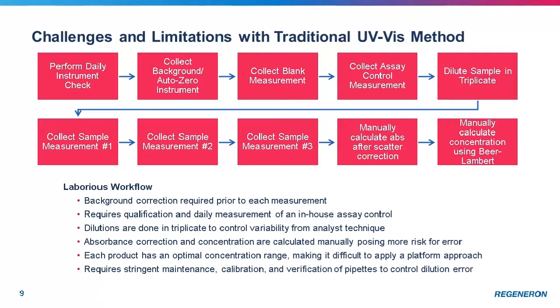Quality control laboratories operate under stringent conditions to ensure that product tested and released into the clinic meets all regulatory expectations and is safe for administration to the patient. A total protein method in a QC lab could incorporate the workflow shown on this slide.